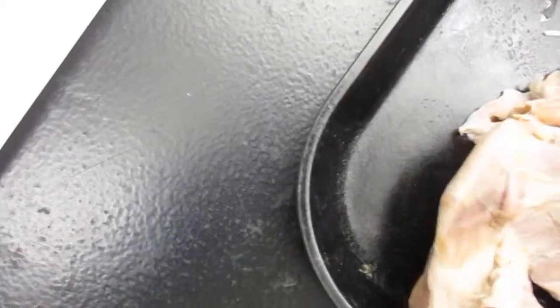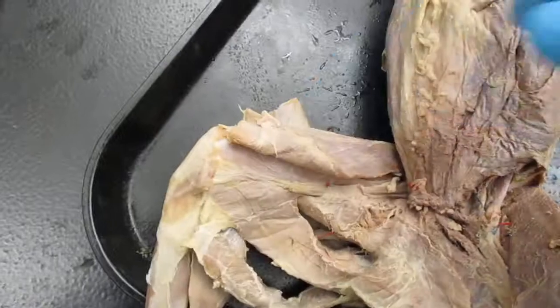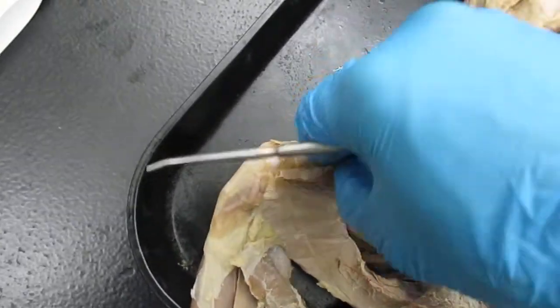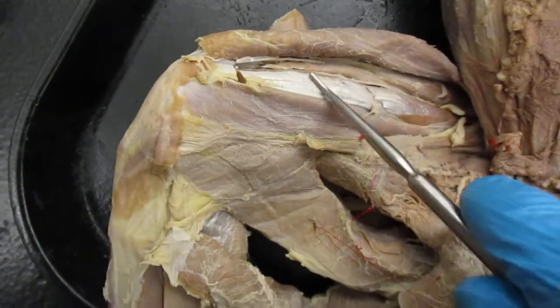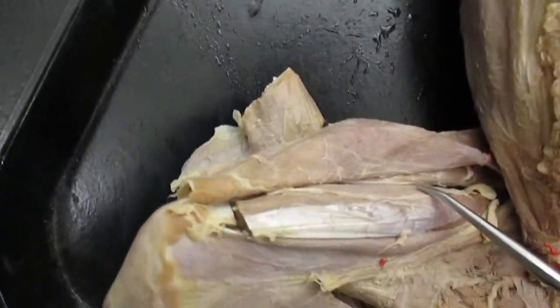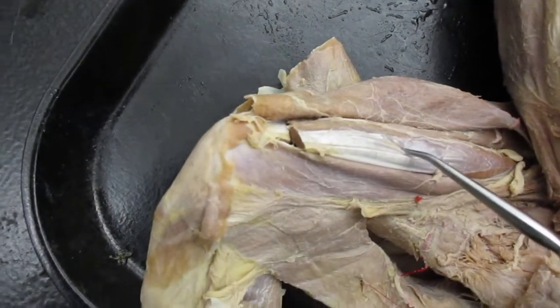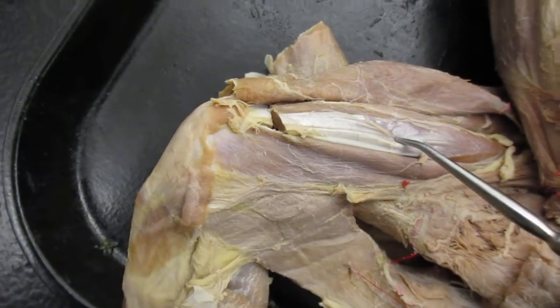So we have 4 quadriceps muscles I want to show you, and right here we have the sartorius muscle that has been removed, as we see here. Now we have the quadriceps muscles that are exposed. So right here we can see the prime mover, which would be the rectus femoris or your quadriceps femoris. So your quadriceps femoris or rectus femoris.